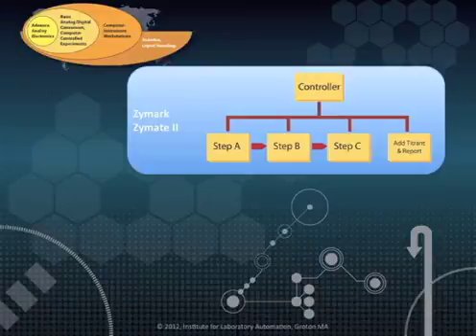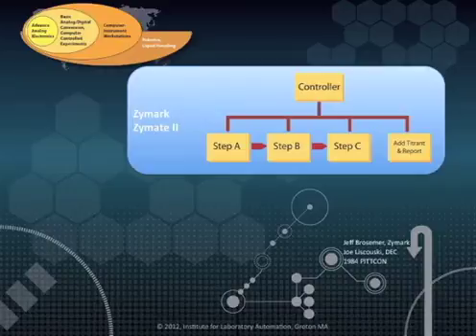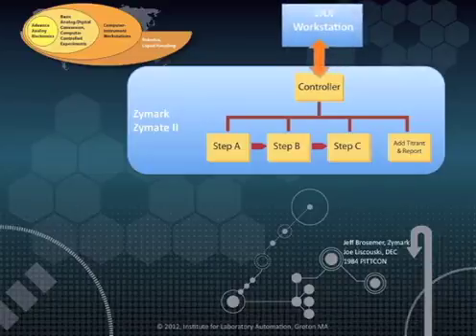Most robotics applications tend to be fairly straightforward and deal with a predetermined sequence of steps that is repeated over and over. At the 1984 PitCon conference, an annual laboratory trade show, the results of a collaboration between Digital Equipment Corporation and Zymark was shown. The problem that we wanted to address was the ability for a computer to take over the control of the robot and adapt the robot's behavior as the experiment progressed.